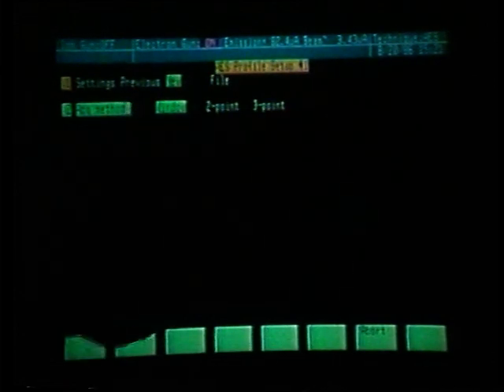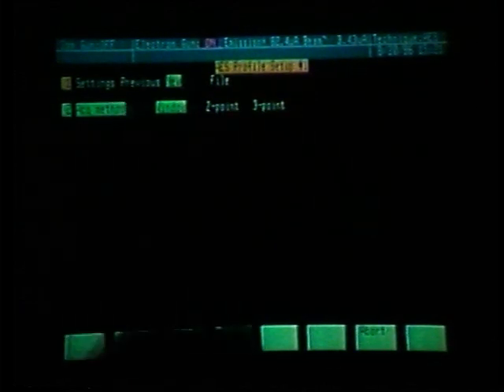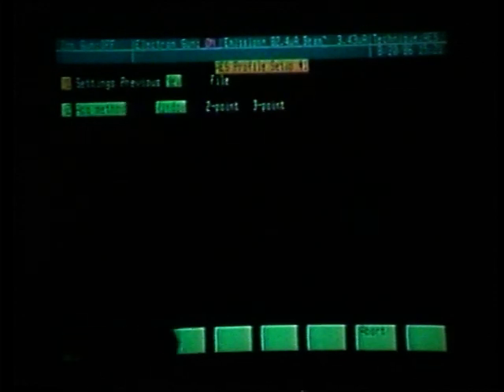If we want 90 data points on a 2-point profile, we can use 45 sweeps. With 45 sweeps, we get much better signal to noise. So there is definitely advantage time-wise and signal to noise using the 2-point and 3-point profiles. The disadvantage in the 2-point and 3-point profiles is that if the peak shifts slightly, we cannot adjust for that shift. Whereas the window will allow us to monitor the peak and background with some leeway, because we normally set the window a little bit wider than the actual peak itself.